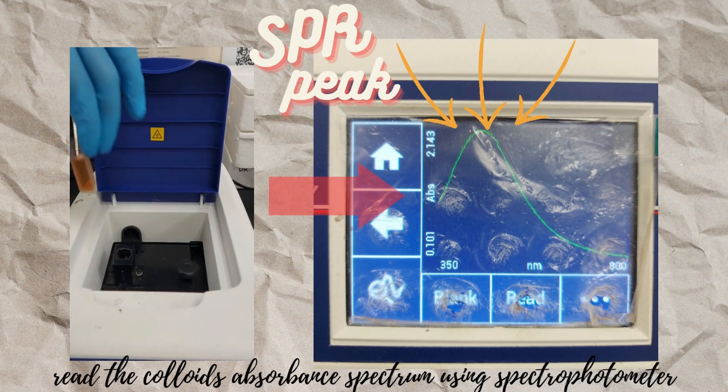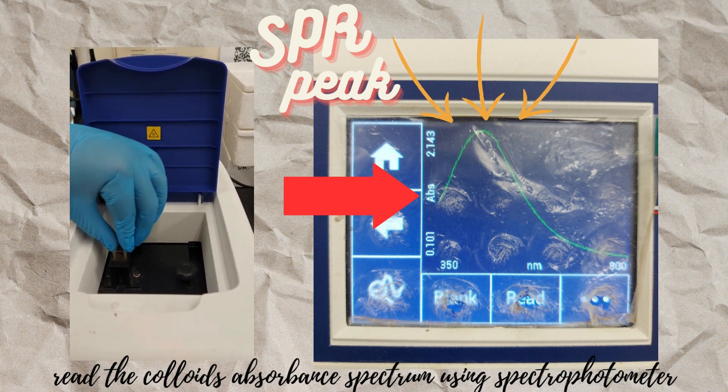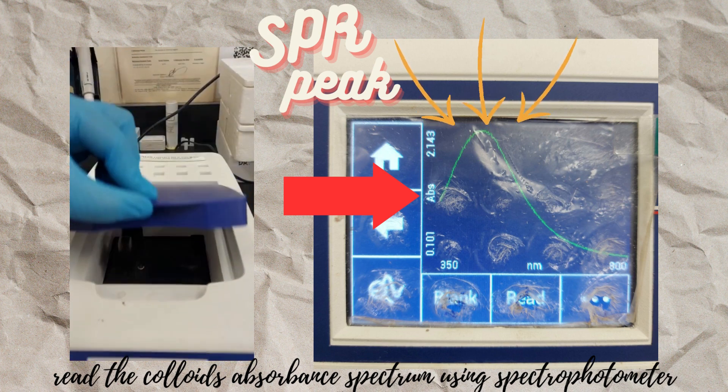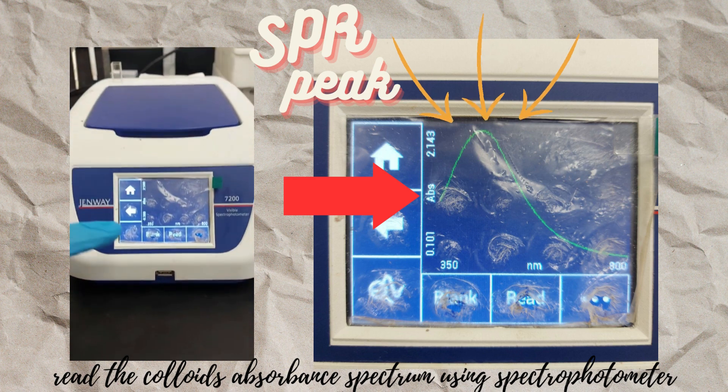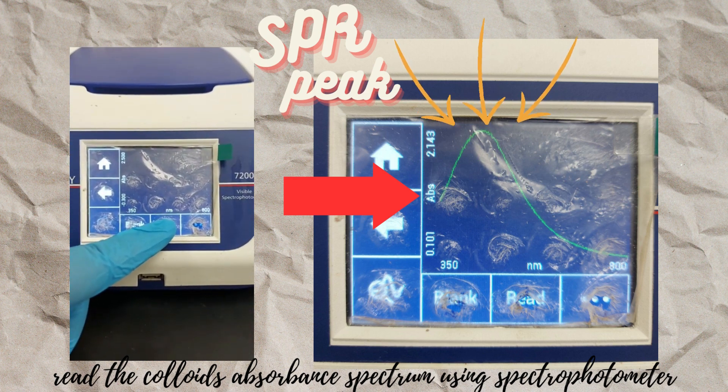Finally, you can confirm your silver nanoparticle's formation using UV Visible Spectrophotometer. The spectrum of the graph should contain a surface plasmon resonance peak like this one.